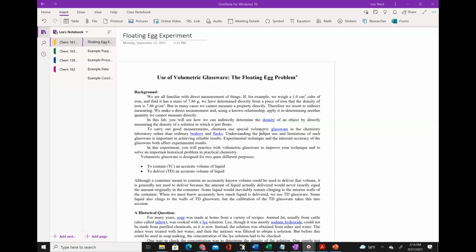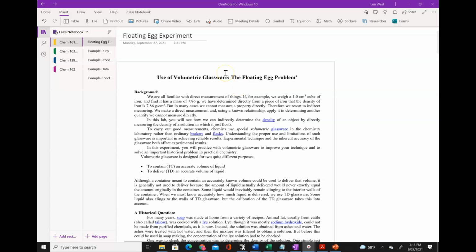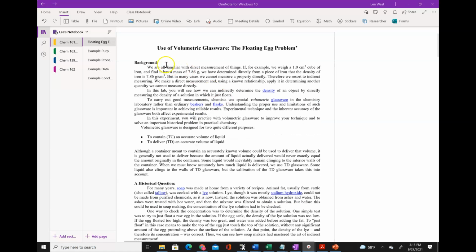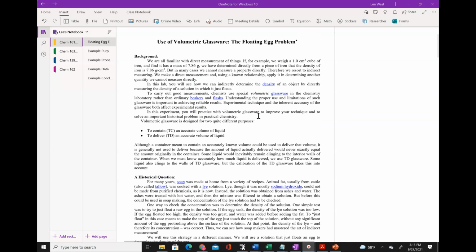Okay guys, so in this video I'd like to talk a little bit about the specifics of getting your notebook ready for week 1. Well, it's actually week 2, isn't it? For lab 1. So the lab that we're going to be doing is this use of volumetric glassware, the floating egg problem. And in this lab, what we're going to be doing is making some salty water that is just able to float an egg.